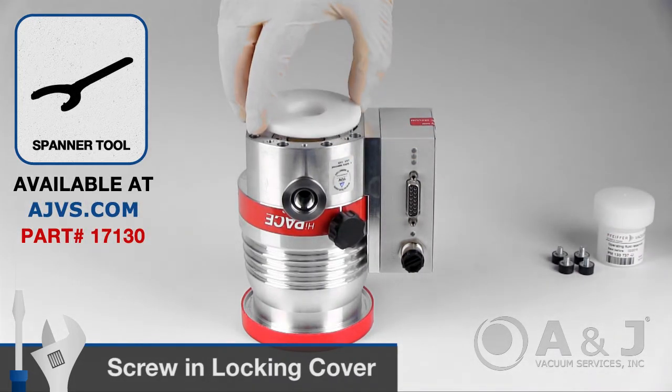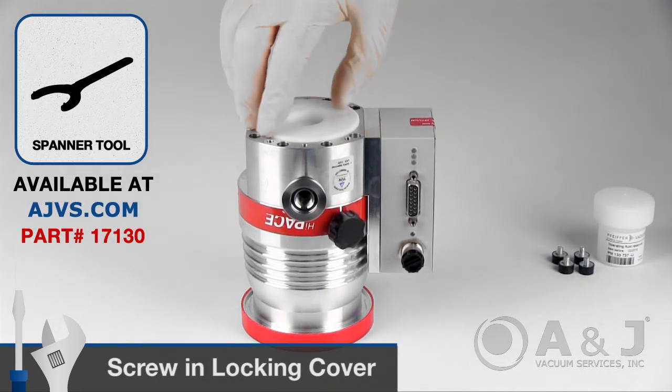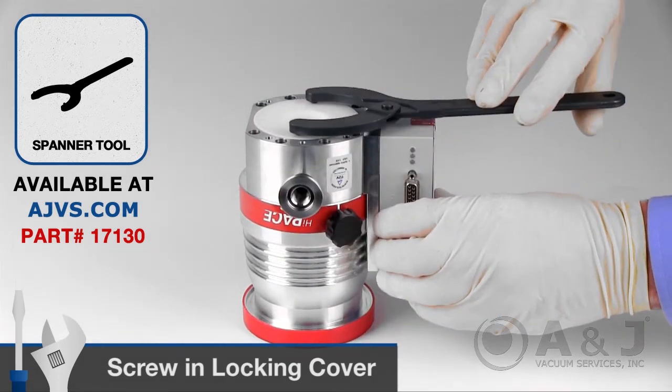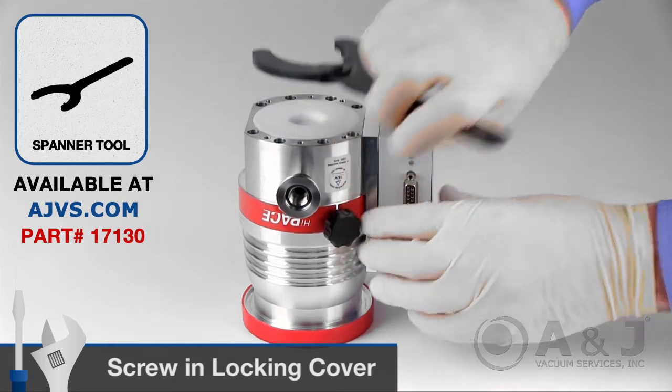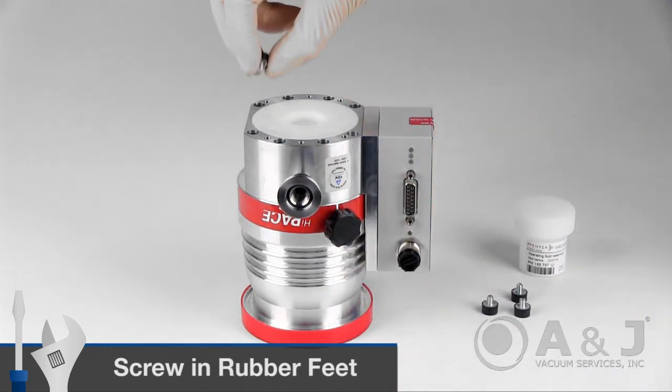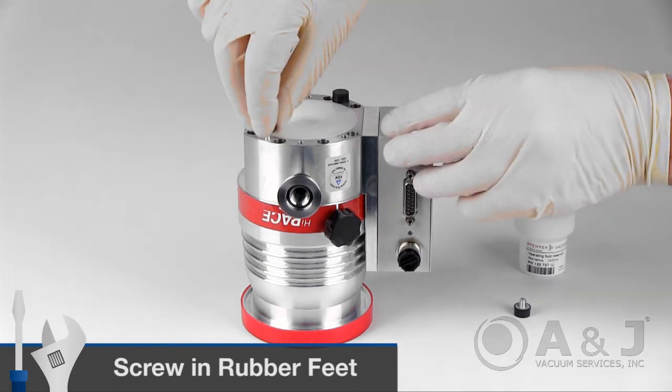Screw in the locking cover and tighten with the spanner wrench tool. The operating fluid reservoir is automatically brought into the correct axial position. Finally, screw the rubber feet back into the bottom of the Pfeiffer HiPace 80 turbopump.